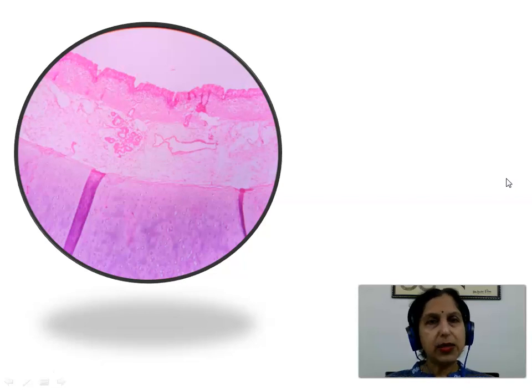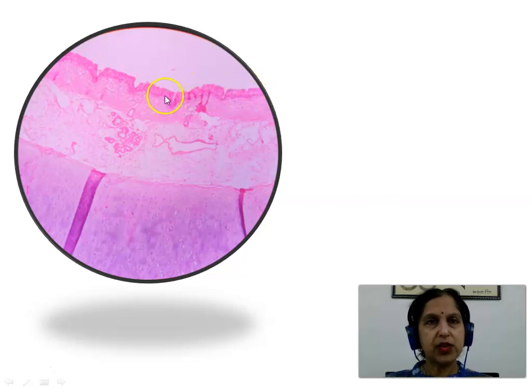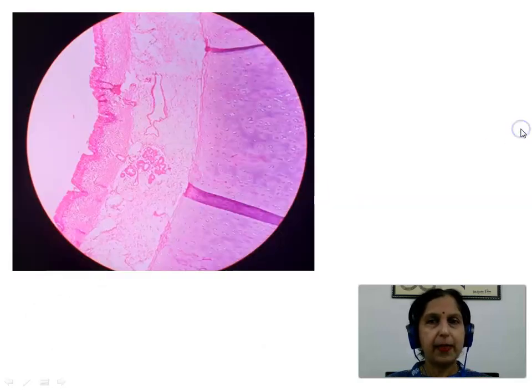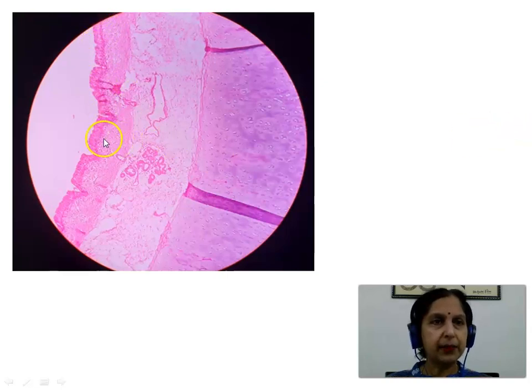Here is a low-power field view of the slide of trachea showing the luminal surface. We see the lining epithelium of the mucosa — pseudostratified ciliated columnar epithelium with goblet cells — the lamina propria, the submucosa with mucus glands with serous demilunes, and the hyaline cartilage. Another view of the same slide shows the lining epithelium, mucosa, lamina propria, submucosa with glands, and hyaline cartilage.